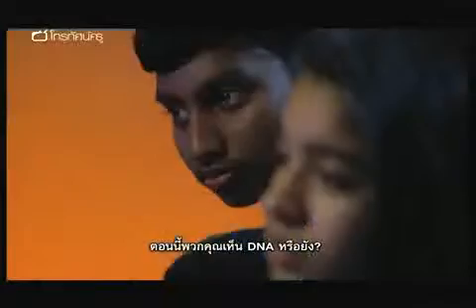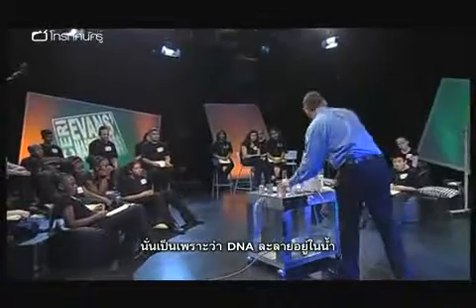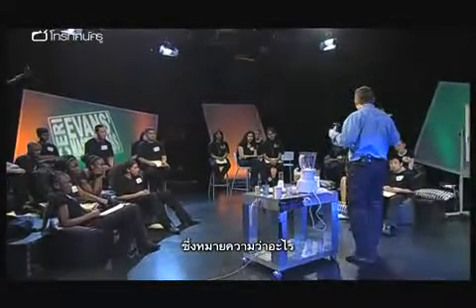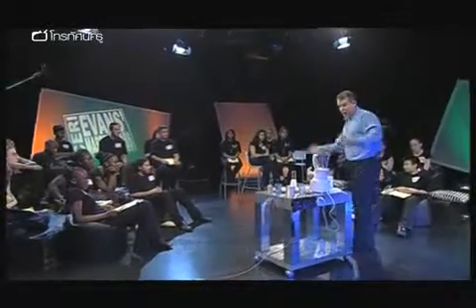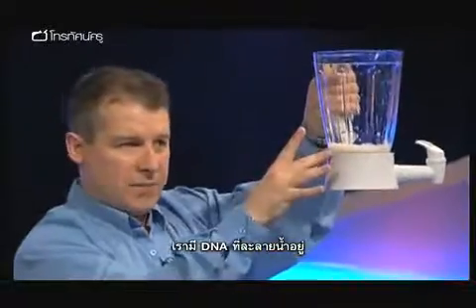Can you see any DNA? No. That's because DNA is actually soluble in water, okay? It's soluble. What does soluble mean? Yes, Tony? It can dissolve. It can be dissolved, yes. So what we have is the DNA which is dissolved in there, okay?